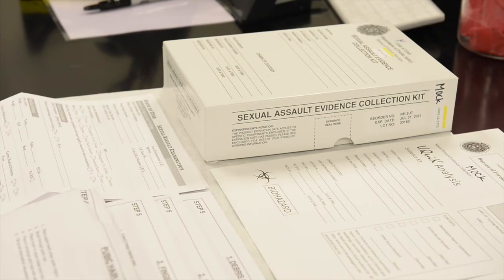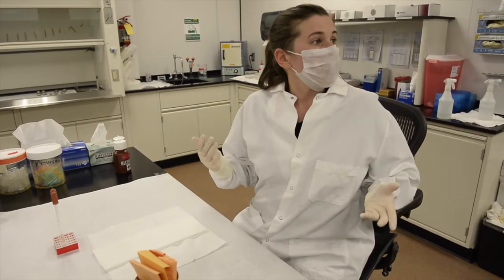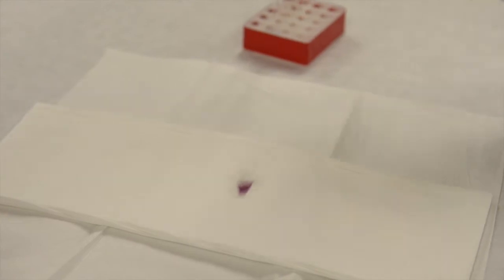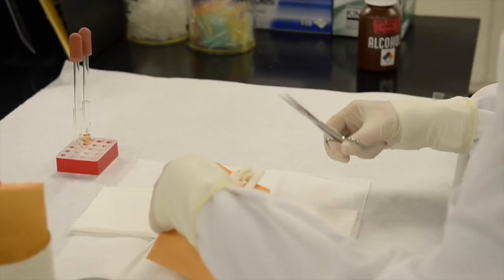Inside each one of those is a potential swab. For larger pieces of evidence, the lab workers will use screening tests, like this alternative light test, to find potential DNA evidence. Another test, called an AP test, can also show whether seminal fluid is present. Put the dye on it, and it will turn into a purple color if it's positive, and if it's negative, it will just remain clear.